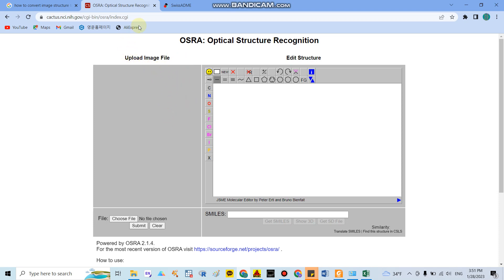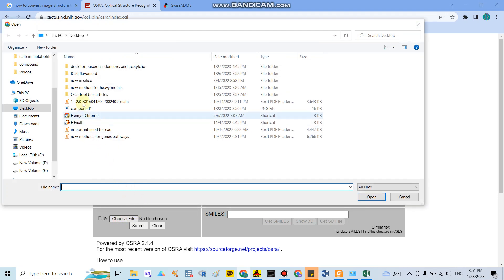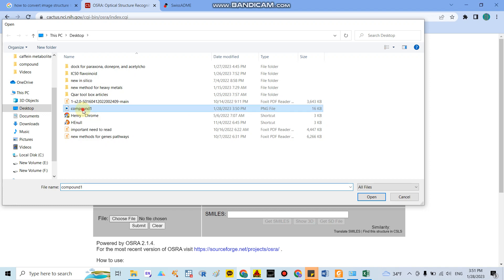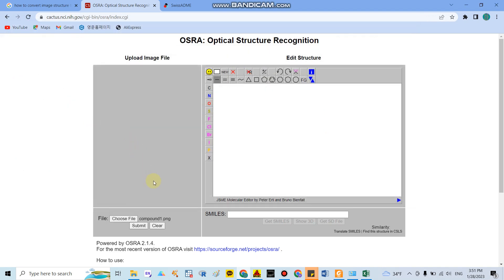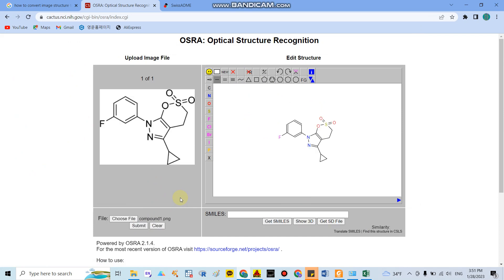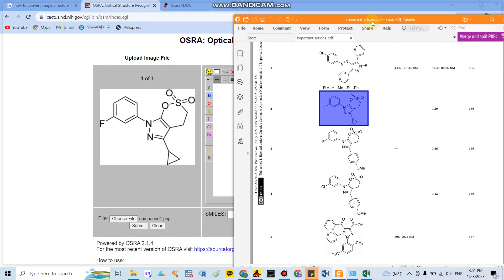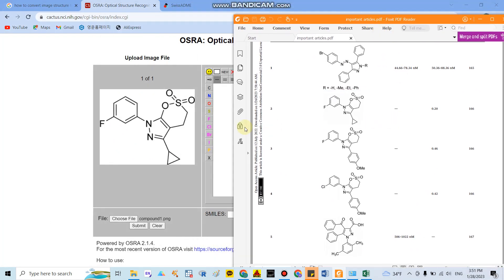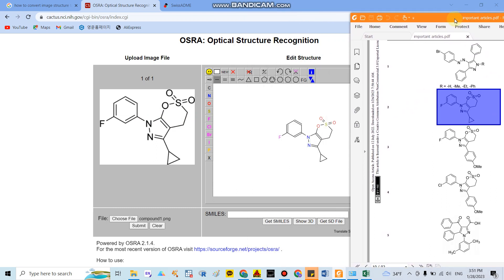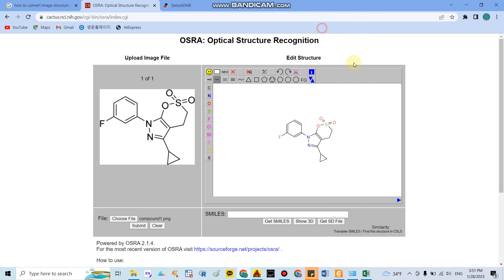After you enter this website, you choose your image. I choose the image in the desktop. After that you upload and submit this compound into the website. As you can see here, you can check whether or not the compound is similar with your image. The compound here is similar with the compound we take from the PDF file.